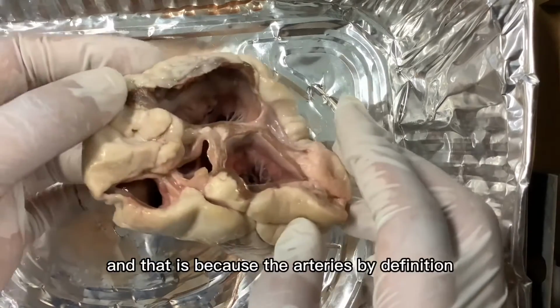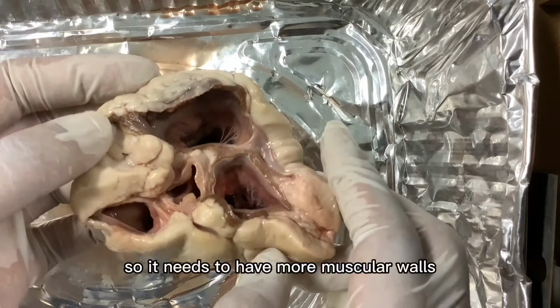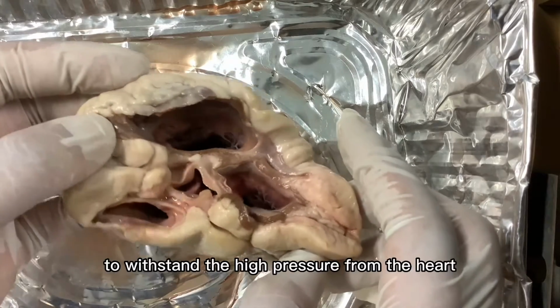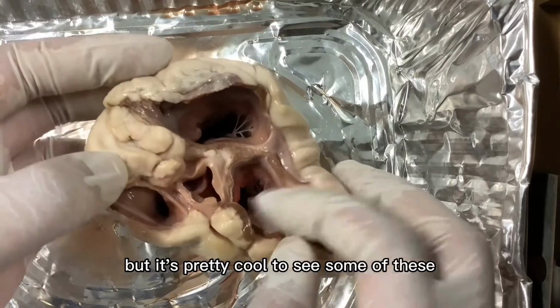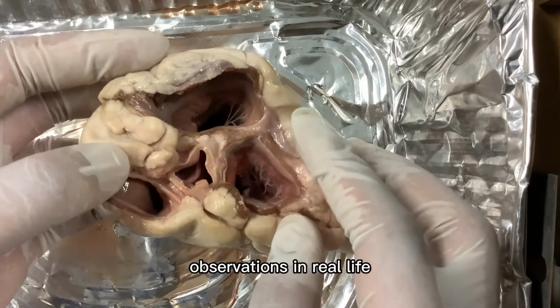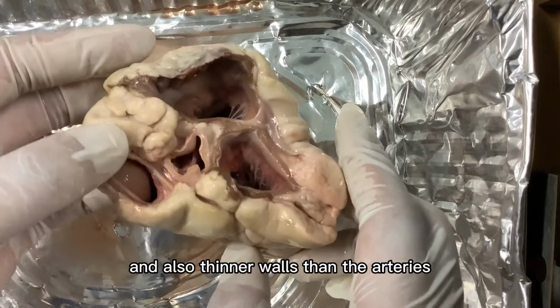That is because the arteries, by definition, lead blood away from the heart, so they need more muscular walls to withstand the higher pressure from the heart. You might have learned these concepts in class, but it is pretty cool to see these observations in real life: the veins have a wider lumen and also thinner walls than the arteries.